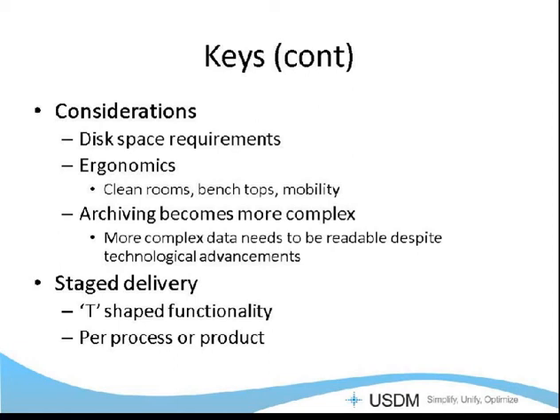Sometimes the desktops or laptops don't travel very well to where they can be destroyed by the chemicals in the lab. And also, I see a lot of tablets. People think they want tablets, and they wind up not really liking them with having gloves on, or getting them messy, or just not being ergonomic for them. And they also tend to have legs. So you need tight controls. I've been places where they would not allow tablets because they tend to get stolen. So there's the extra security there.